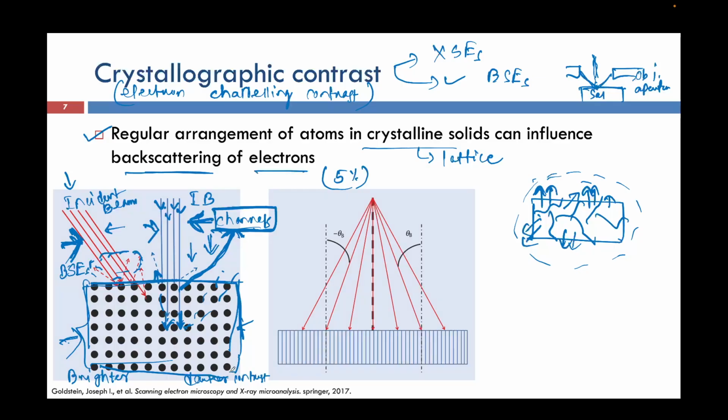Giving an example, let's say this is my single crystal, since all the grains are oriented in a particular manner. When I am trying to scan the single crystal, let's assume for now that this is a very large single crystal and I am scanning with different beams, from position number 1 to position number 7. In between there will be some angle. Before that, we will go a little bit into how this scattering phenomenon will occur.